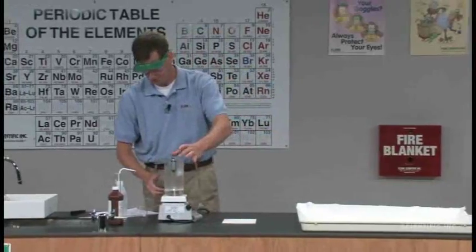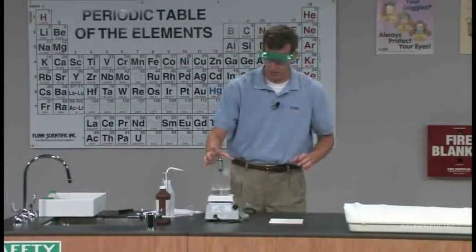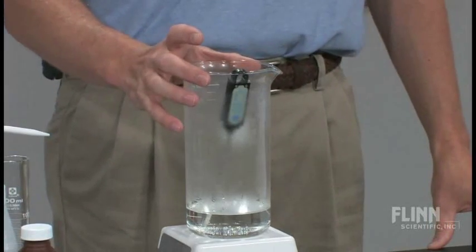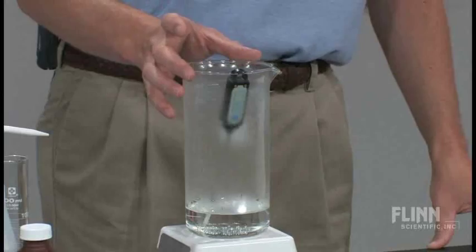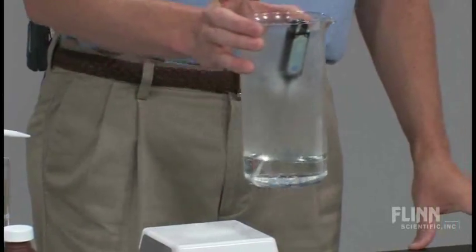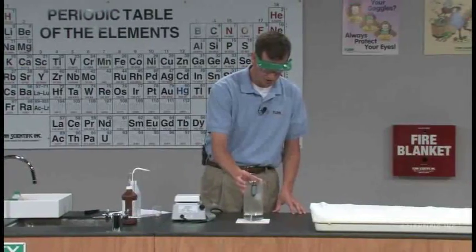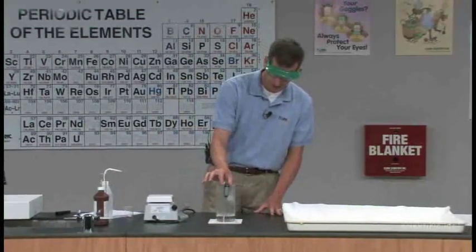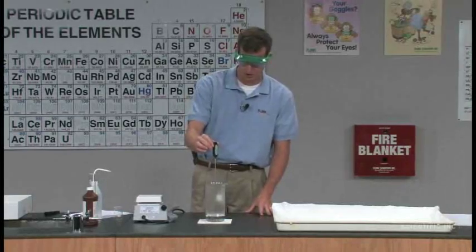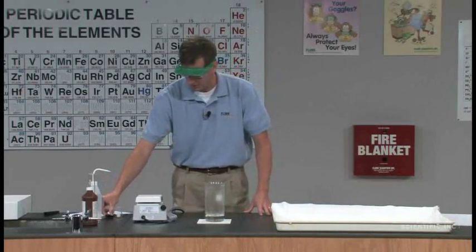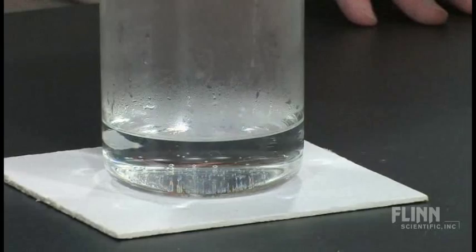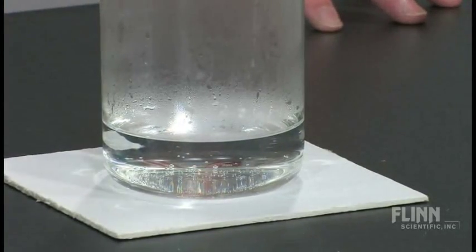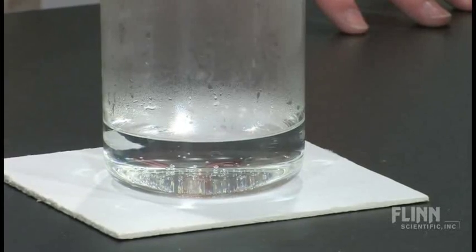What I've done here is I have potassium sodium tartrate, approximately 100 milliliters of a 0.21 solution heating up. To that, I've added about 40 milliliters of 6% hydrogen peroxide. I've heated this up to approximately 70 degrees Celsius, and I'm going to set the thermometer aside, and I've got just a few bubbles forming in there. One of the main products of this reaction is carbon dioxide.